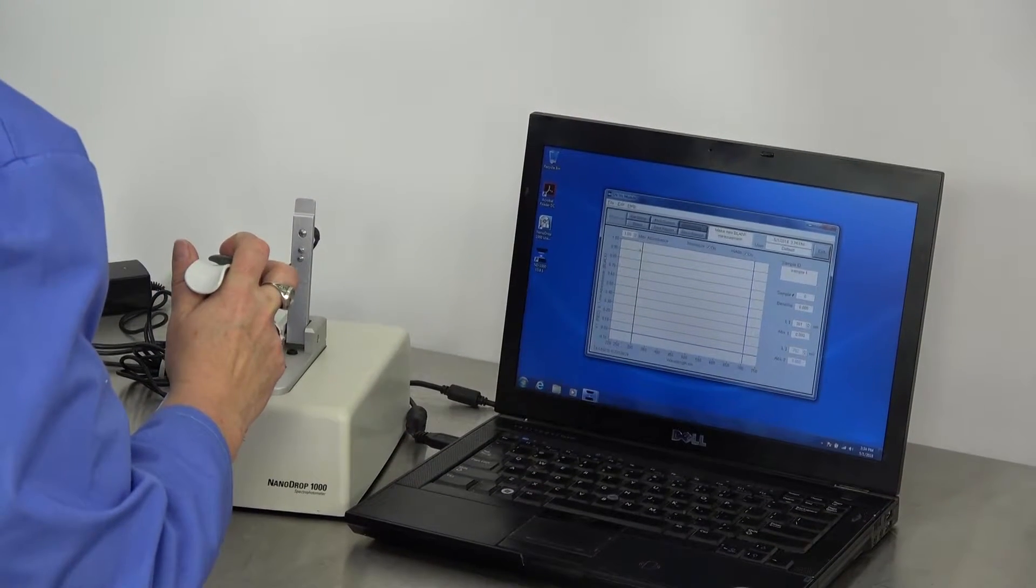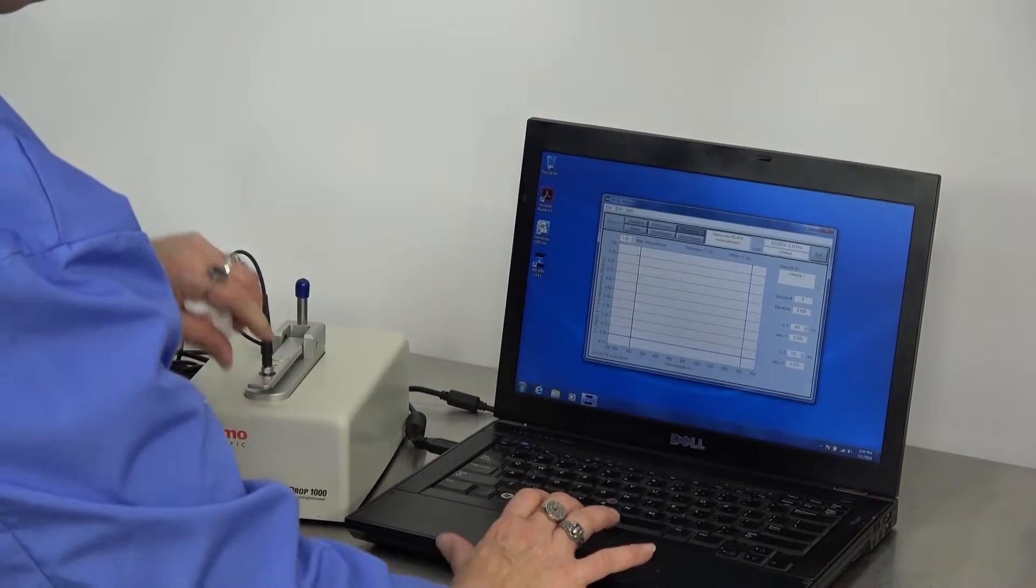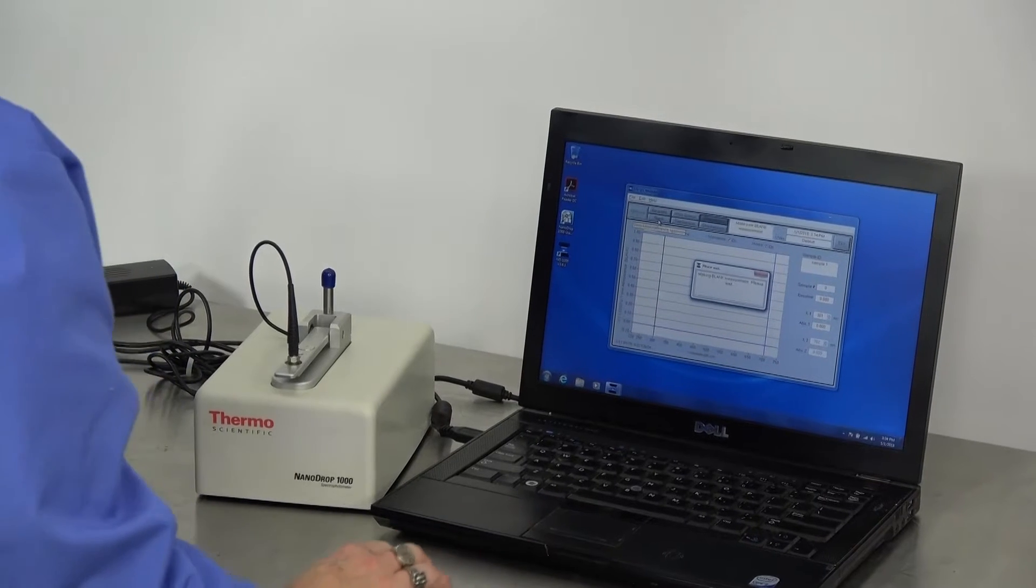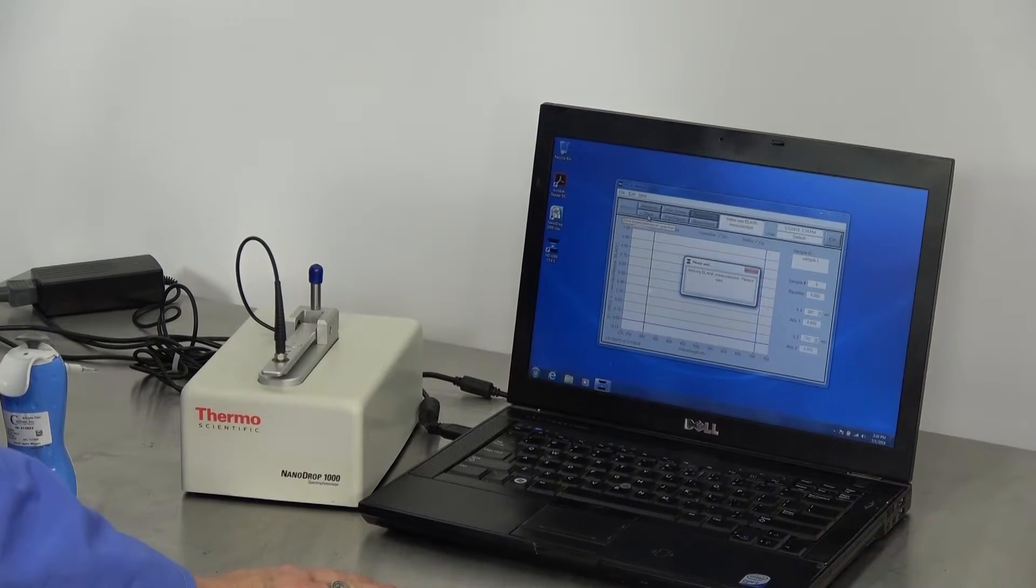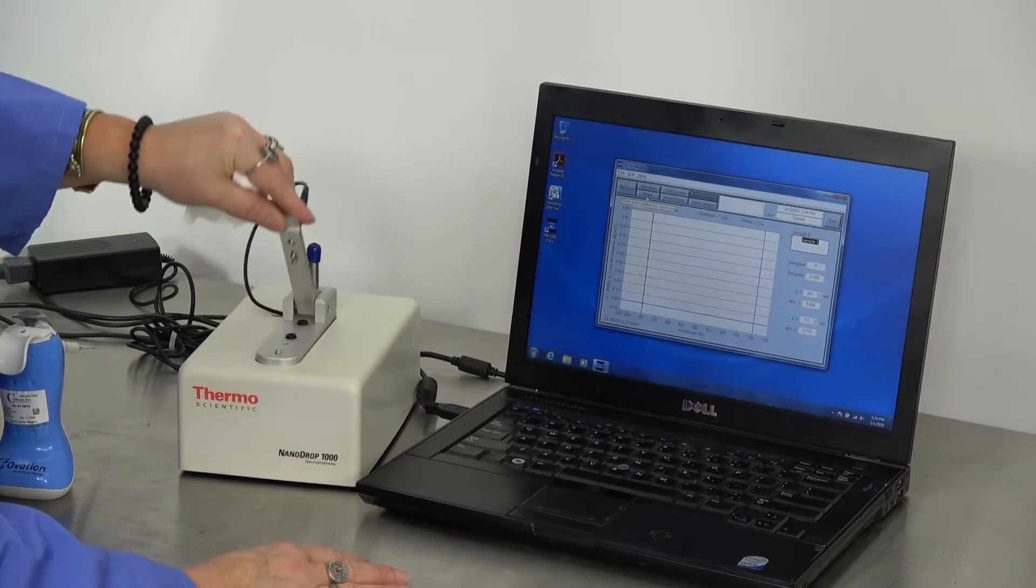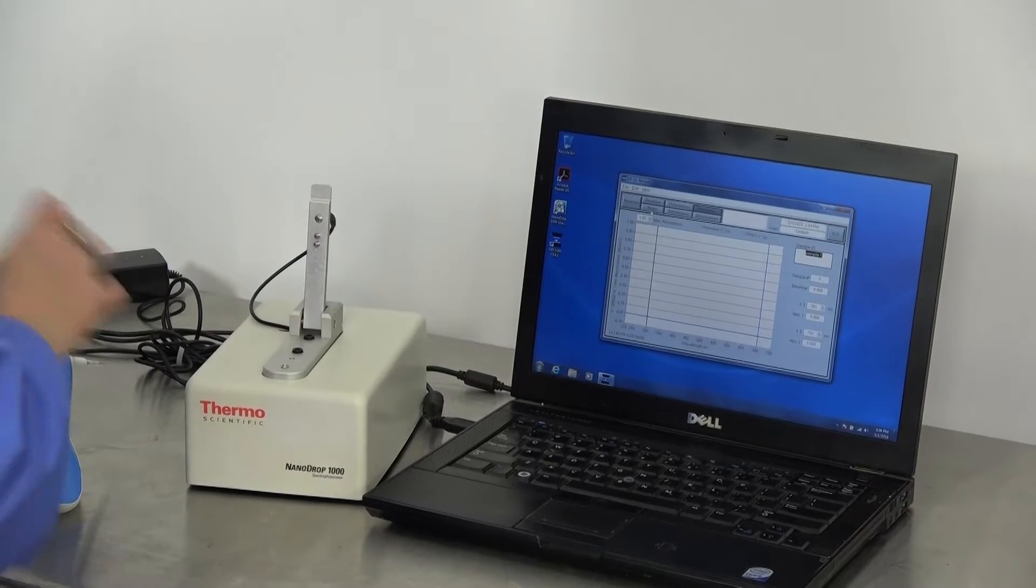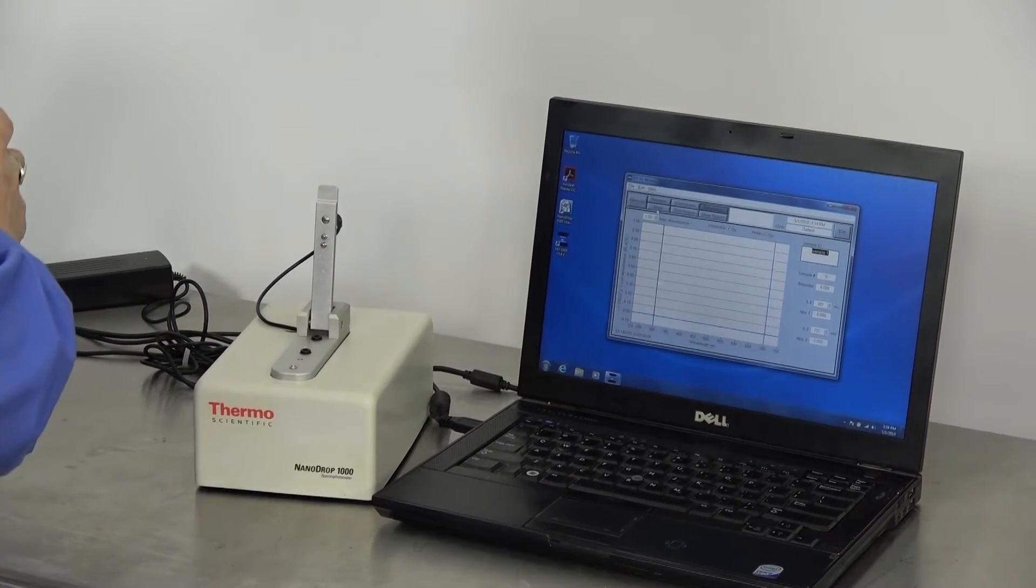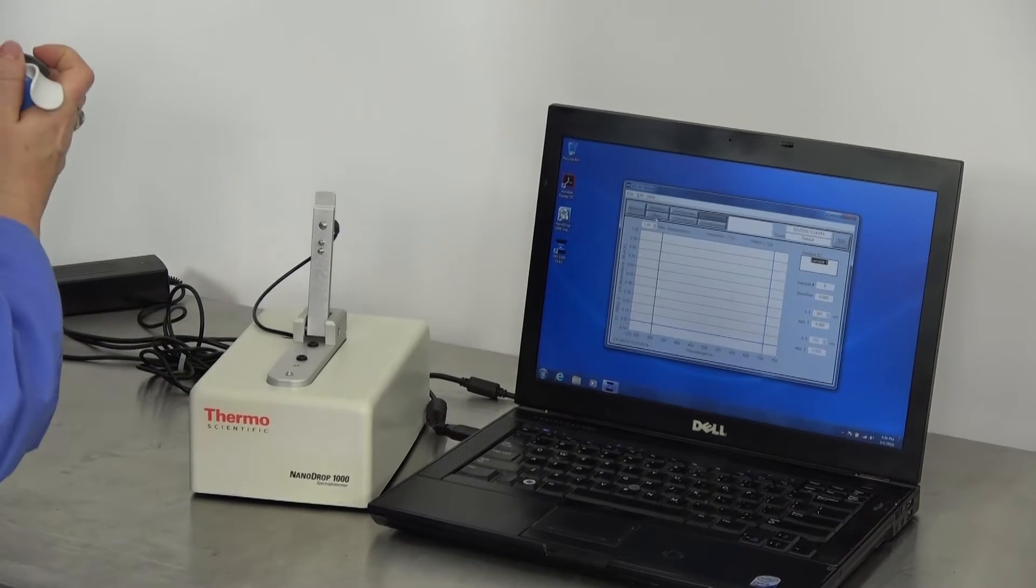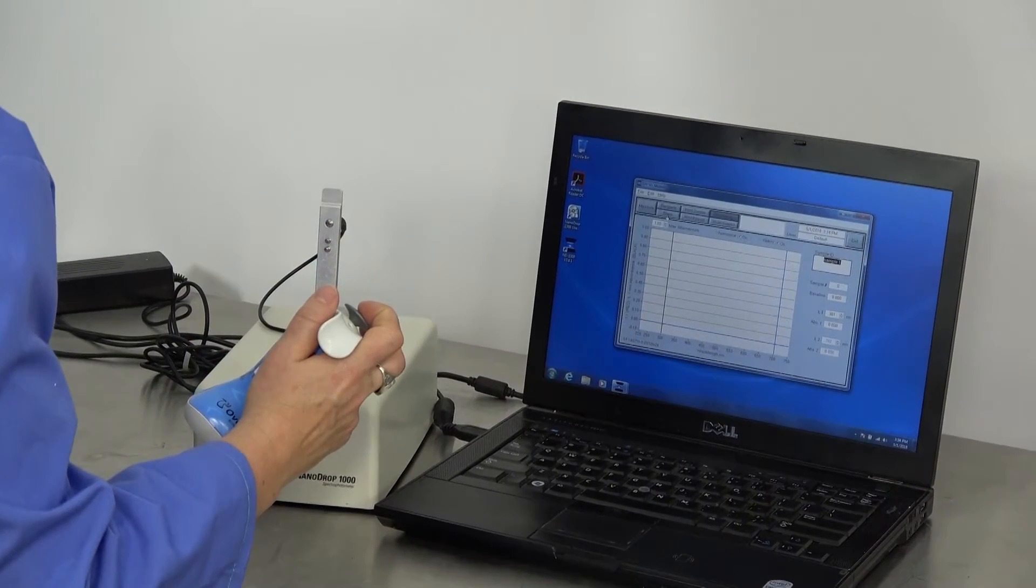First, you'll run a blank. And then you'll run your sample.